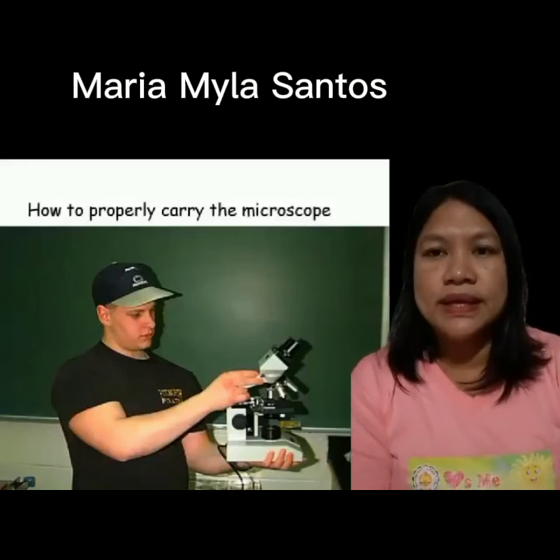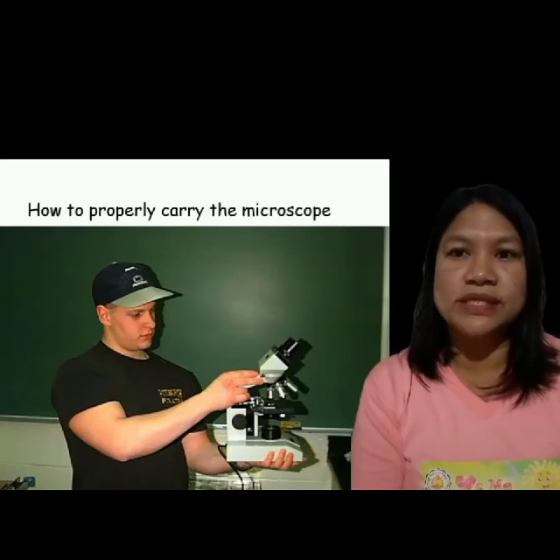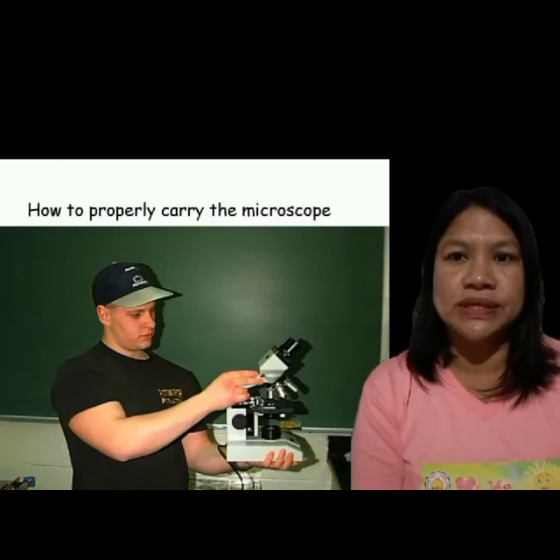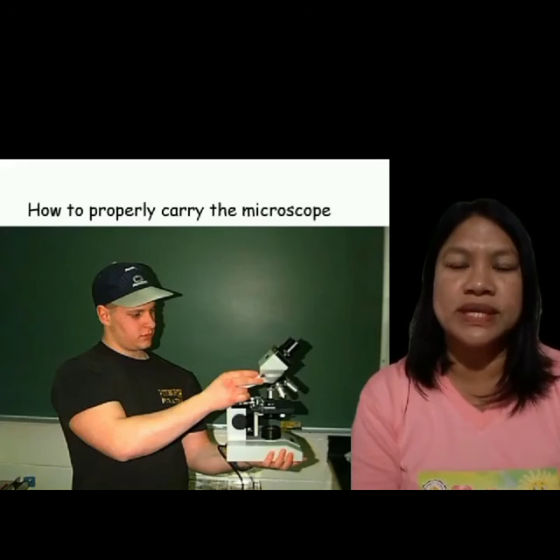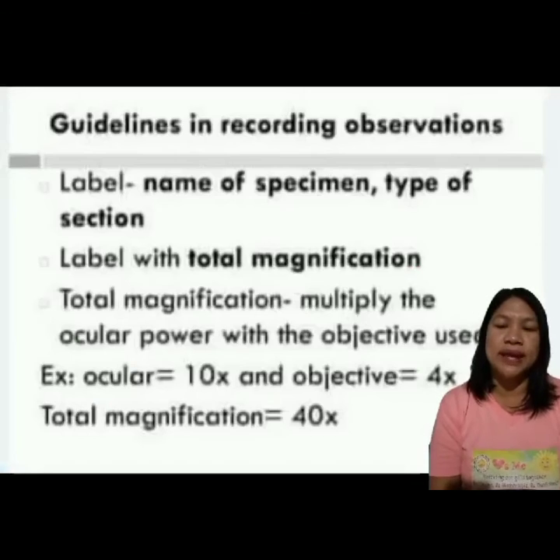Guidelines in using the microscope. Always carry it with two hands, one under the base and the other grasping the arm. Carry it in an upright position. Stage and objectives are at their farthest distance apart and lowest. Start the observation at low power. Never adjust the coarse focus when using the high power objective. Never move the objectives and stage towards each other while looking through the ocular. To avoid eye strain, keep both eyes open when viewing the specimen or cover one eye with your hand.